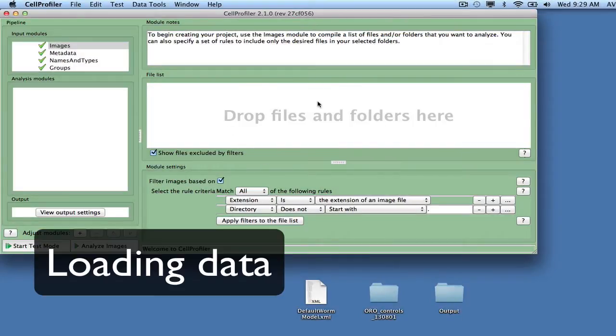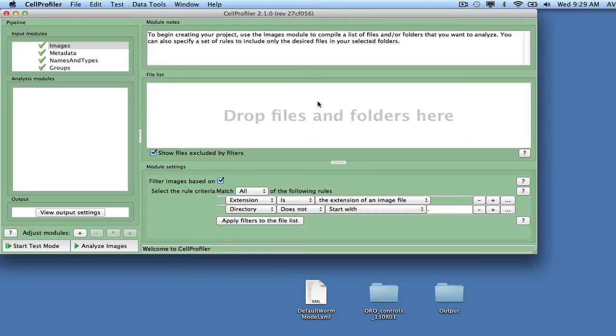To provide CellProfiler with image files to be analyzed, drag and drop the input image files into the file list space.